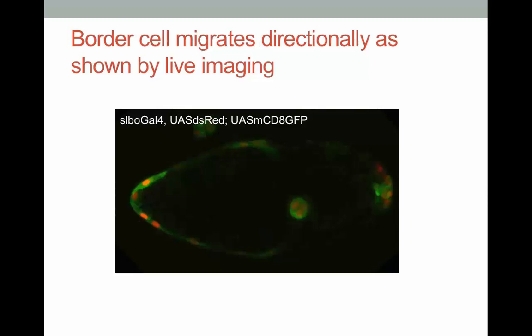How we do that is to use the surface tracking of Imaris. After we track the surface, we're able to get the statistics, and from the bounding box algorithm, we can get the real-time cluster diameter. And also from the statistics, we can get the real-time speed at each time point. So this has been really helpful to us.